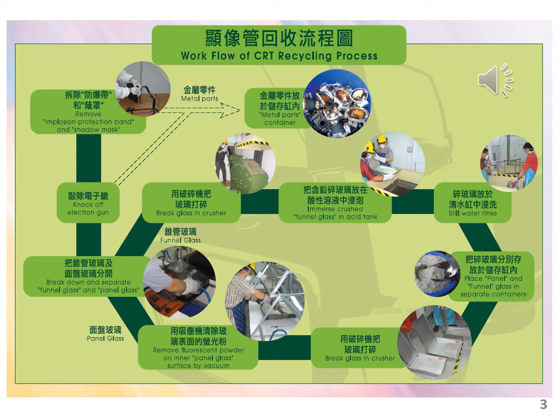This page shows the government arrangements or regulations regarding the workflow to treat the CRT. You can see from the slide that there are a bunch of different procedures, including crushing and making into different pieces and then putting into the acid. So the major component of the lab today is to reproduce what we call the TCLP procedure to remove the heavy metal from the waste.